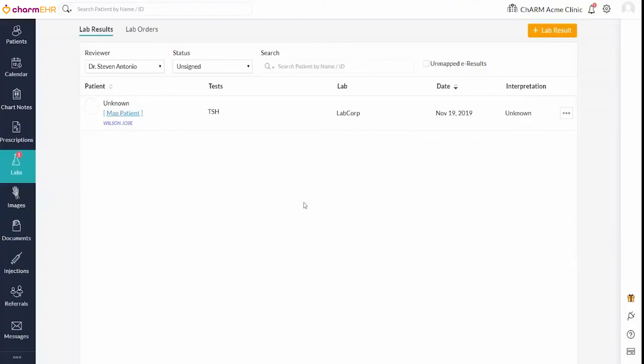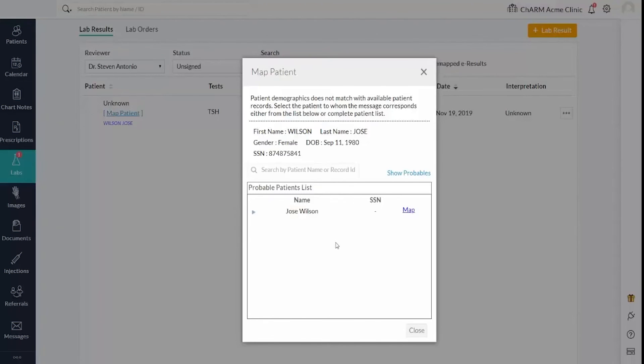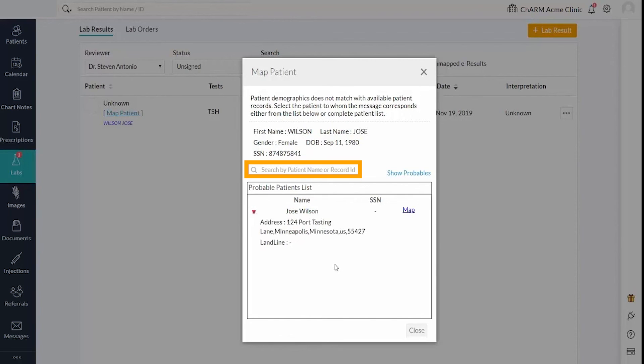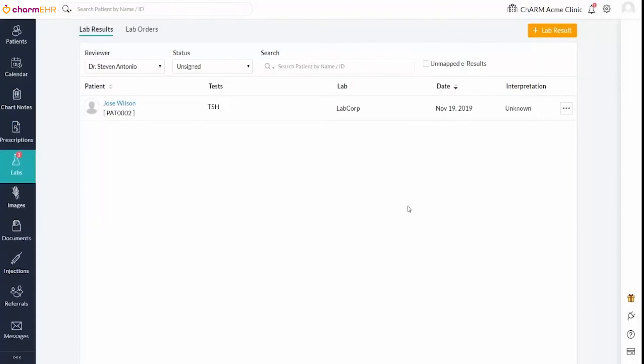The patient can be mapped to this result using the Map Patient option. The Map Patient view displays the patient information received in the result message, as well as the patient details in your account that match the date of birth and gender of the received patient details. If the probable patients list does not have an appropriate patient, use the Search by Patient Name or Record ID field to poll the matching results by name or record ID criteria. Map the appropriate patient to the result. Results can be reviewed after assigning an appropriate patient.